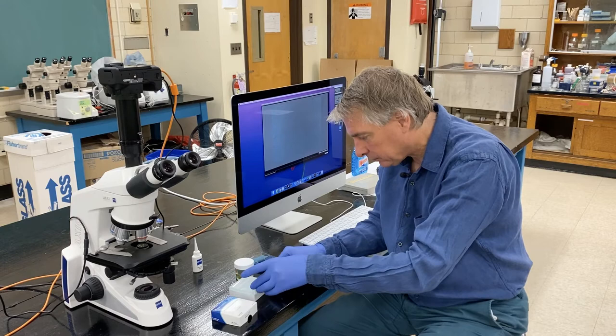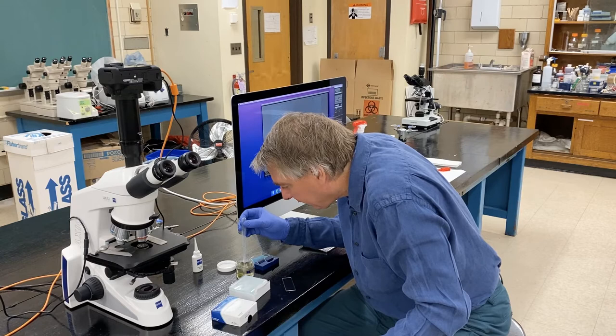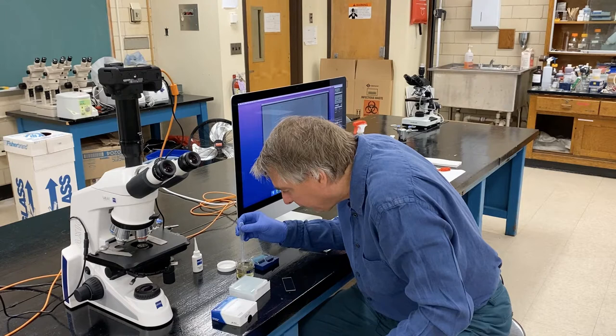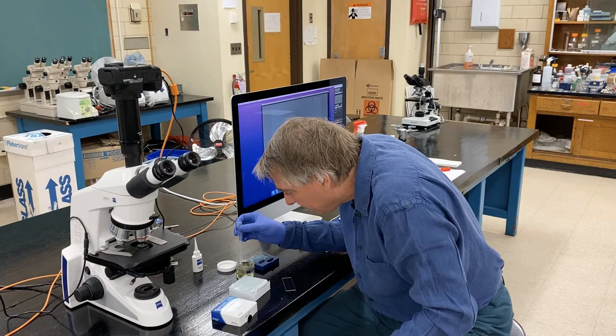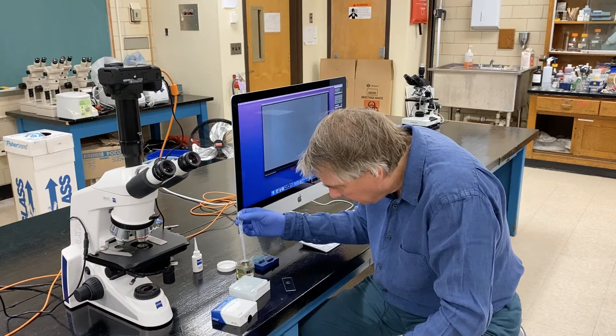So I have one slide here, and I'm going to open the jar. And then, once again, I'm going to reach down towards the bottom because the critters like to settle out down there, and there's some food in the jar for them. And I'm just going to put one drop. That's all I need. Well, it's a drop and a half.